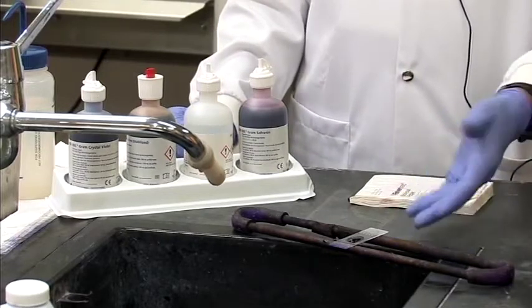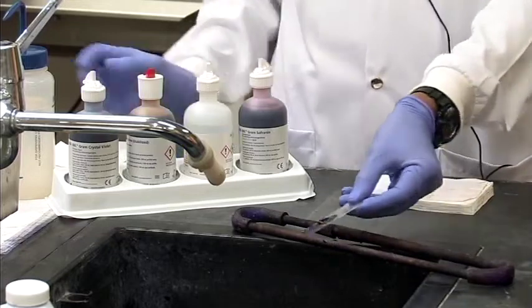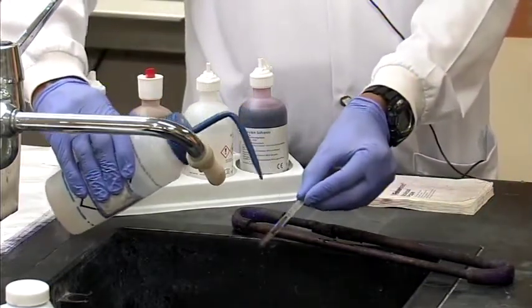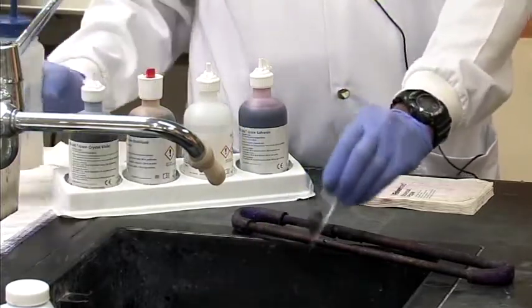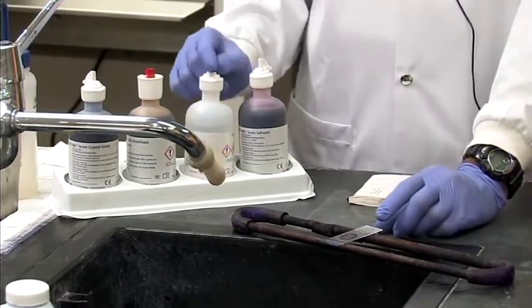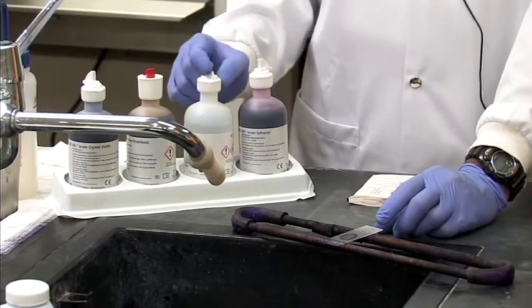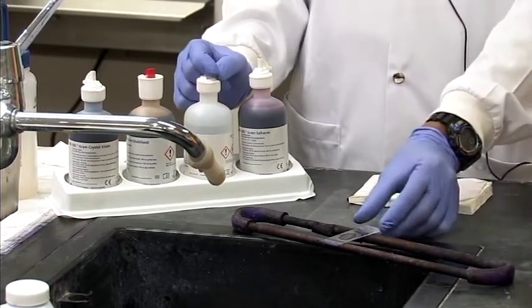So assuming a minute has passed, we're going to decant again and wash off that iodine. Again, do not squirt on the smear itself. Shake off the excess. Now we move to the third stage, which is the most important stage of your gram stain, your decolorizer. Decolorizing takes sometimes a few seconds, depending on the thickness of the smear.